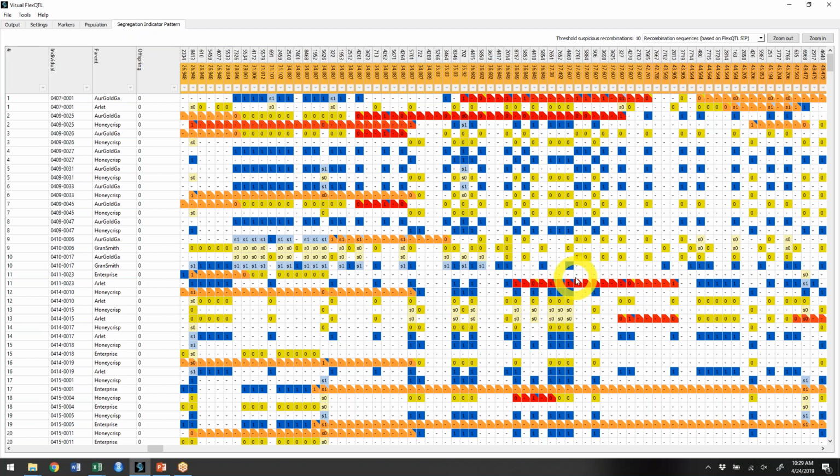Then these 2 become 1. These 2 were not reported earlier because there were 2, so they were not a singleton, but by solving one of them, the second one suddenly stands all alone, so it becomes a singleton and gets reported. So solving singletons might fix a lot of other double recombinations, but it might also introduce new singletons.